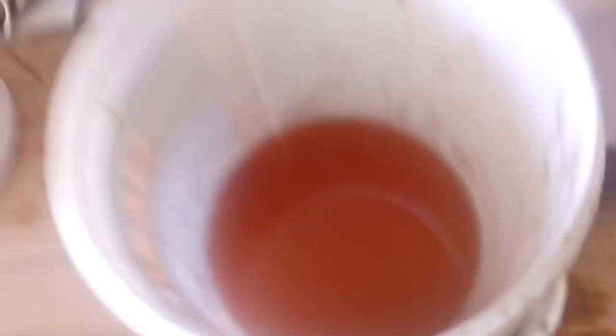Okay guys, we're finished. So this is our solution. It's red because of the disc. Here's our rinse solution and we rinse the disc. And this is our disc.